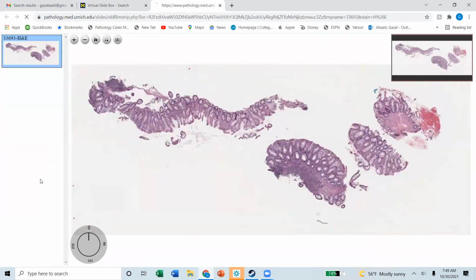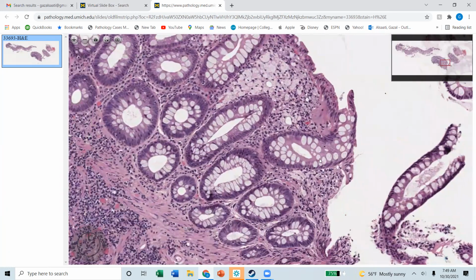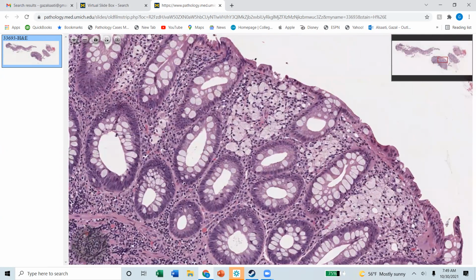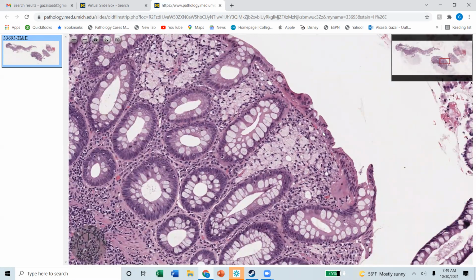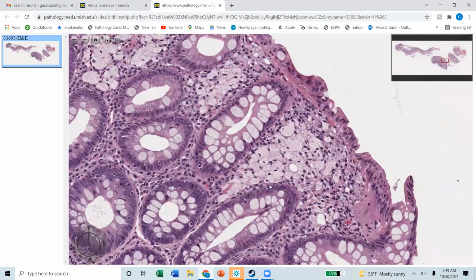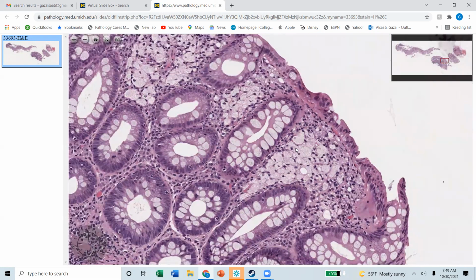Xanthelasma. This is something that we see very often. The doctor will tell you he took a polyp, or not a polyp, a yellow plaque. What would you do here? A lot of the time you don't need to do stains, but sometimes those nuclei are pushed to the edge and you just want to put your mind at ease, and you will do a keratin and a CD68.